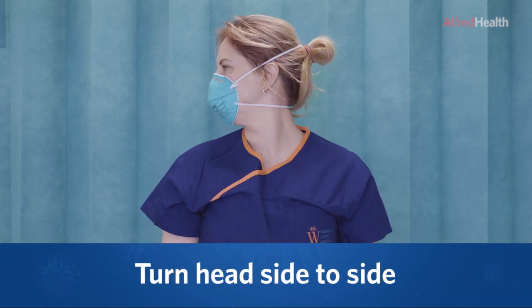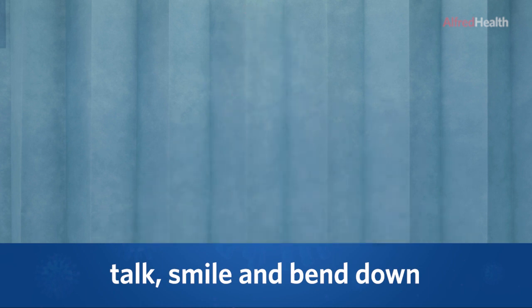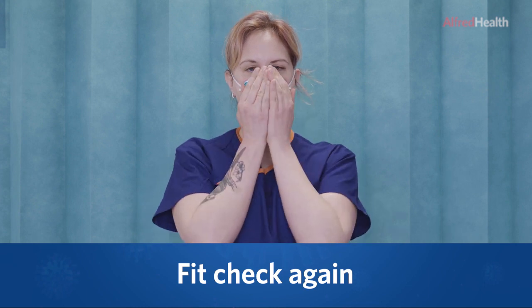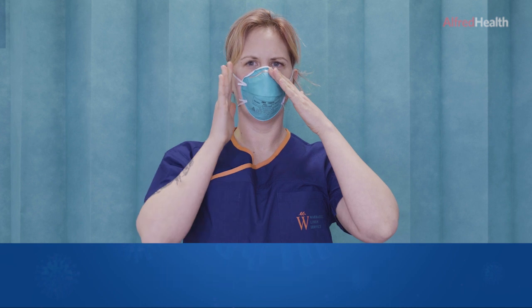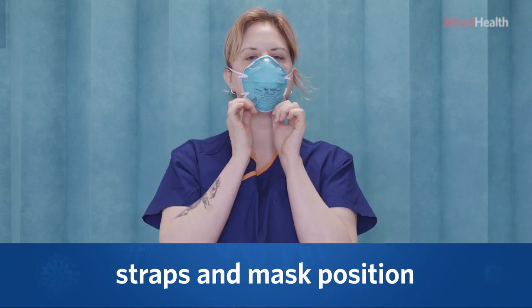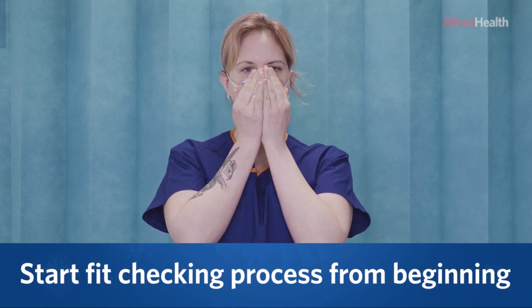Turn your head side to side, talk, smile and bend down. Now fit check the mask again. If any air leaks are felt, readjust the nose piece, the straps and mask position, and start the fit checking process over again from the beginning.